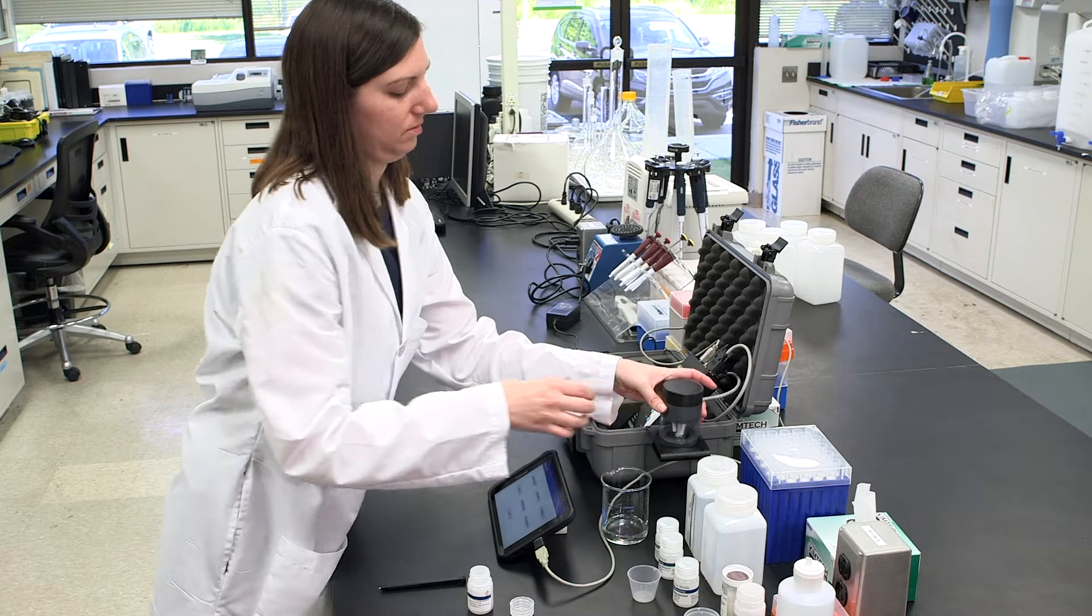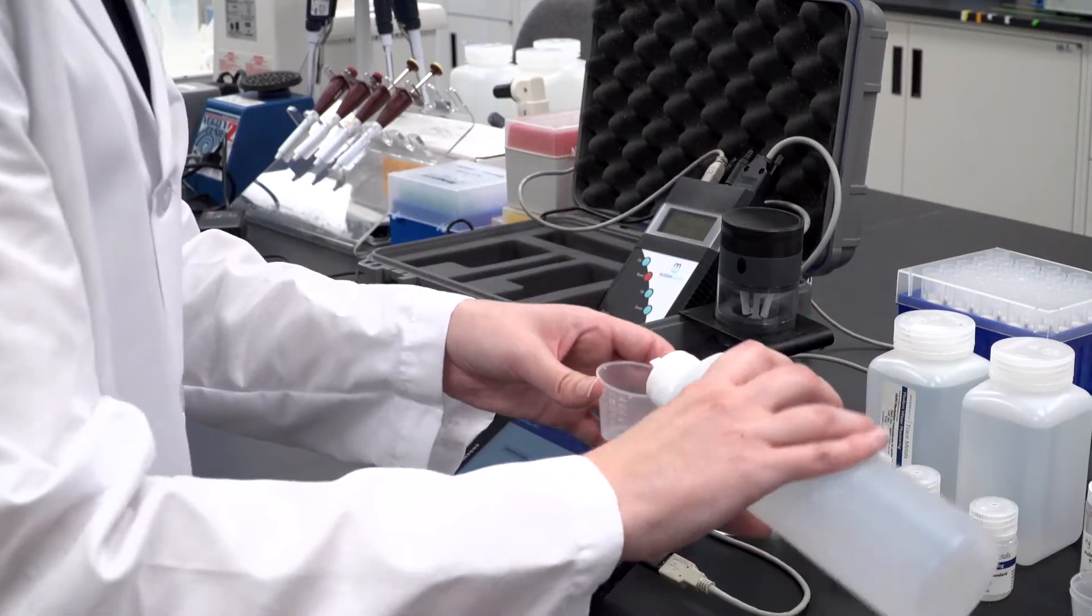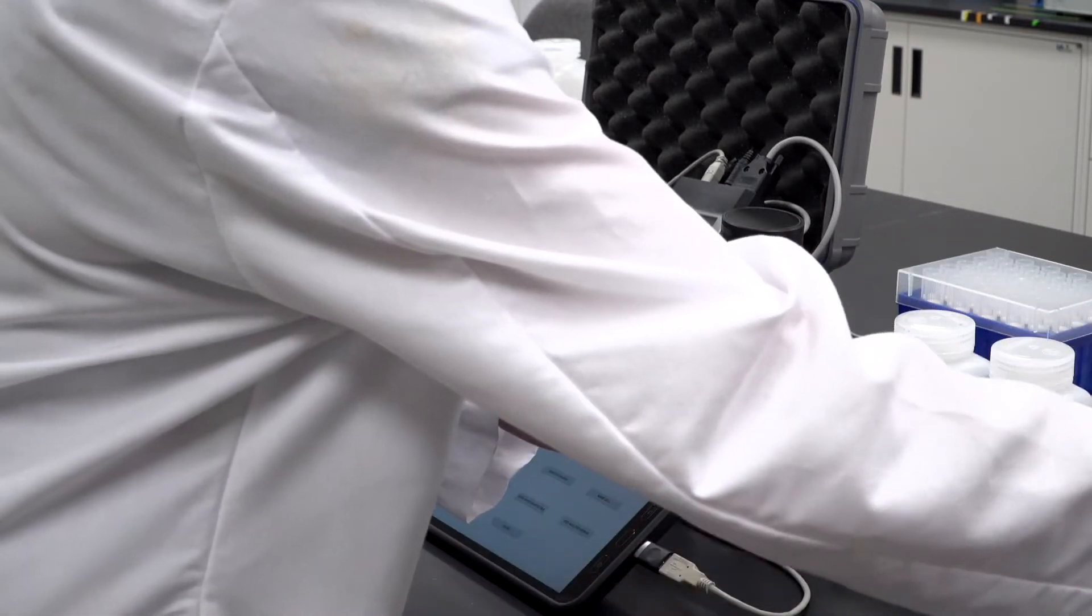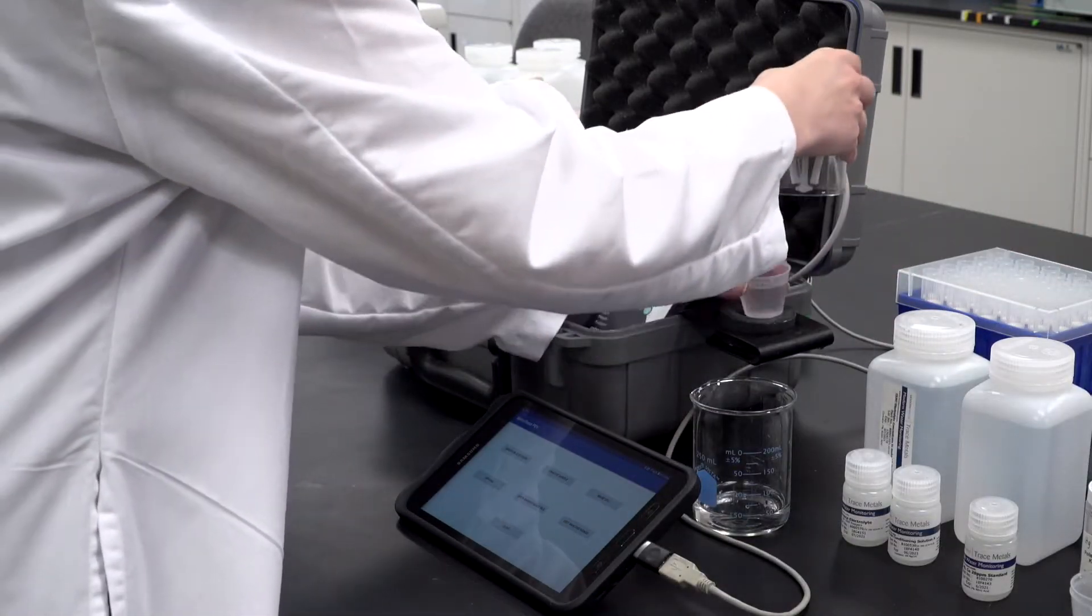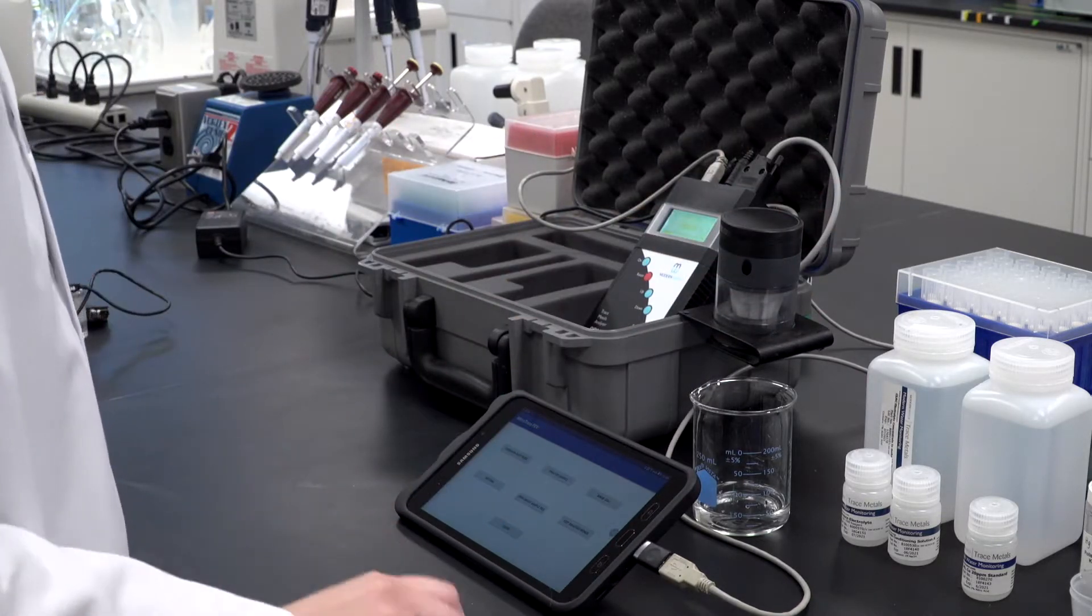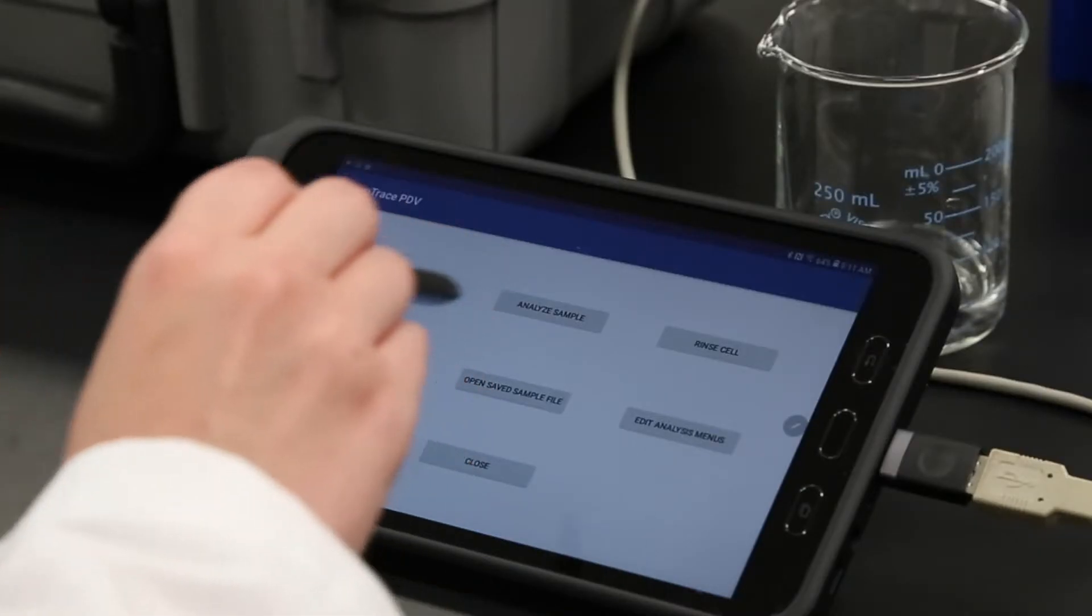At the end of the plating period, pour the plating solution back into the bottle. Rinse the electrodes by filling an analysis cup with 20 milliliters of ultra-pure water. Then run the stirrer using the Rinse Cell button on the main page. Leave the electrodes sitting in the second cup of rinse water. The PDV is now ready to start analyzing solutions.